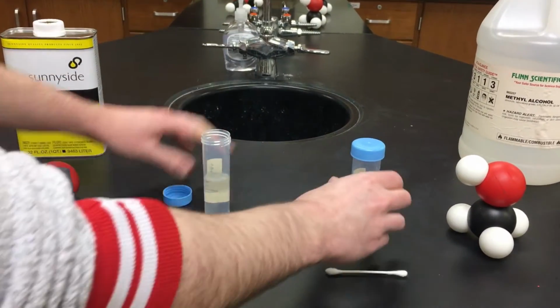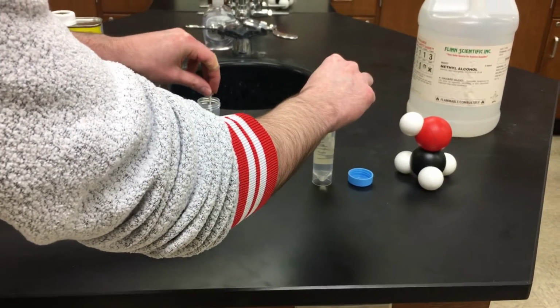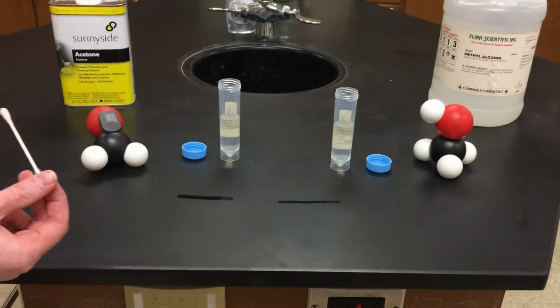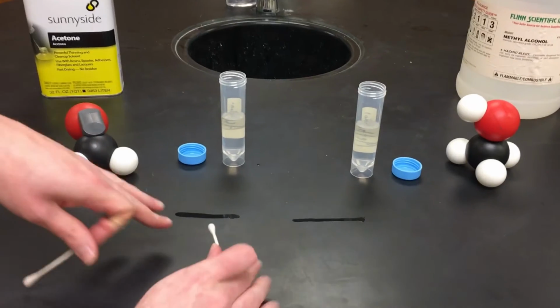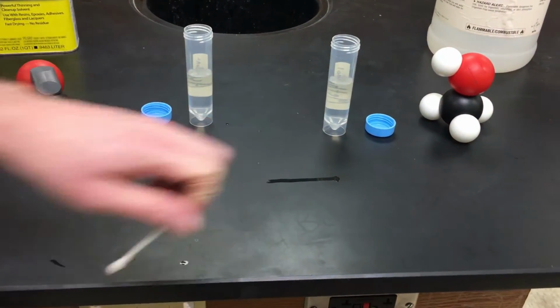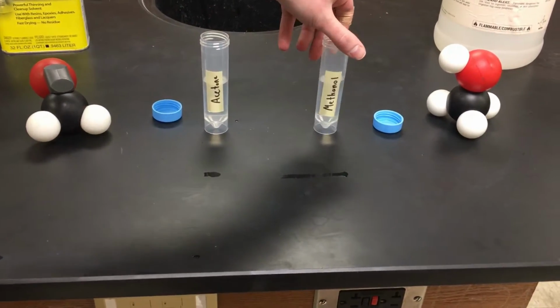But what we're going to do is see how quickly they evaporate. So the rate of evaporation of these liquids should tell us something about the intermolecular forces holding them together. So I've streaked them out onto the table. This is our acetone, and this is our methanol. And our acetone evaporates a lot quicker than the methanol.